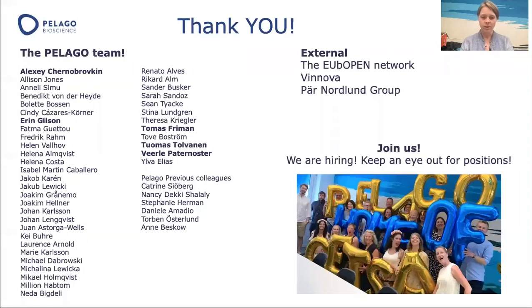Another question here: do you always consider destabilizing shifts to be downstream events? No, the SRC family of kinases is one of the examples that I showed where this is not the case. But downstream events, I would say, I don't have the statistics because we have no method yet to look into the cell to see what's really happening. But if I look at a plot with 10 destabilizing hits and 10 stabilizing hits, I'm more likely to say that the 10 stabilized ones have bound to the compound than I would be to say that the 10 destabilized ones had. I think that the destabilized ones are those that are sort of forced out of their original environment, and where there is no net effect of binding something. So if you have a compound that binds to the protein, at least the net effect could be a happy one, so to say.